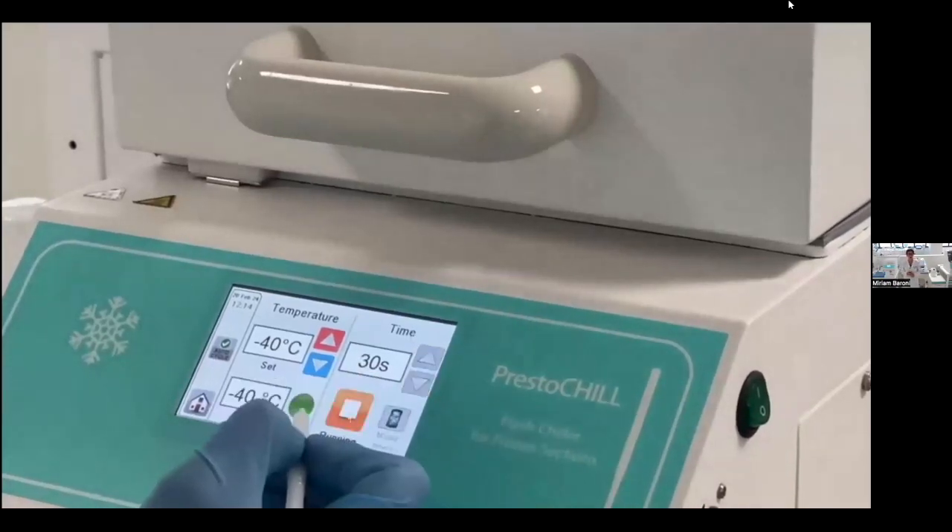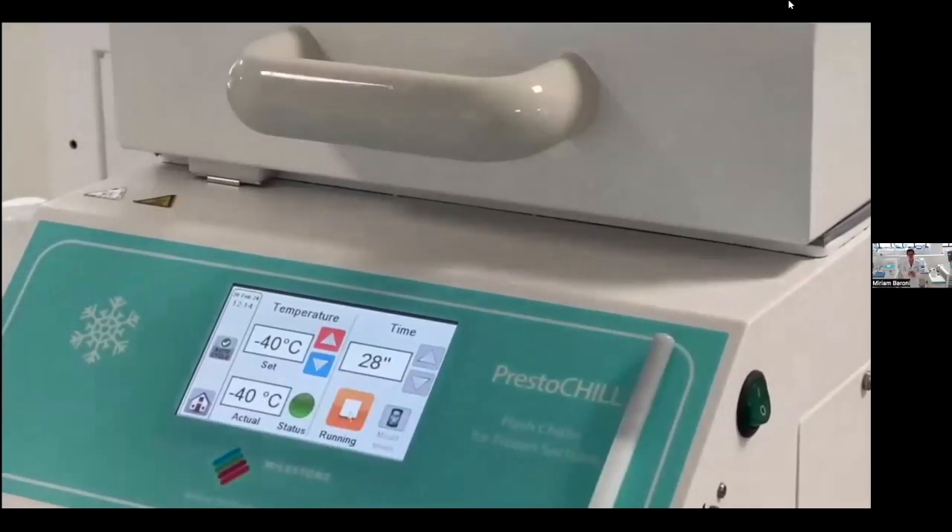Only 30 seconds are enough to completely freeze the sample. Different tissue types — brain, breast, kidney, liver — can all be frozen at minus 40 degrees. What we need to modulate to achieve a better section of different tissues is the freezing time.